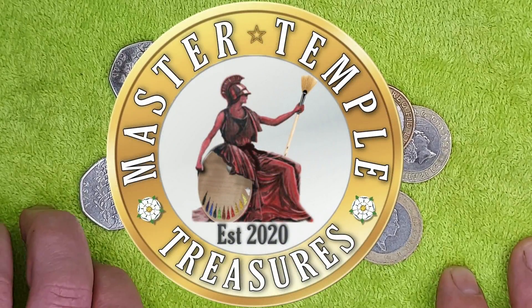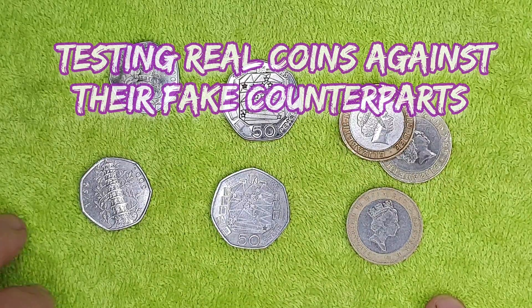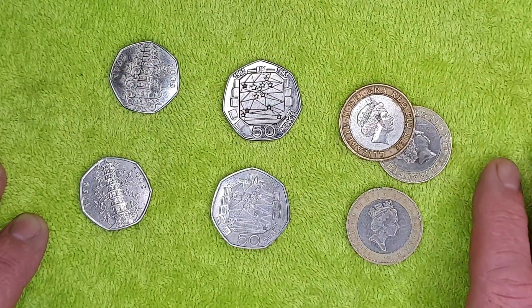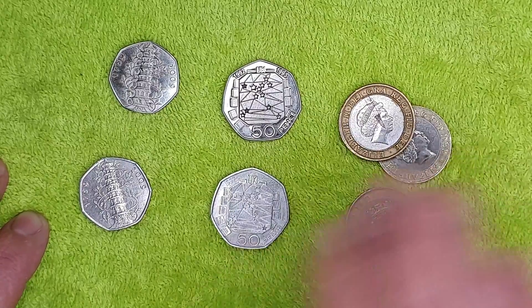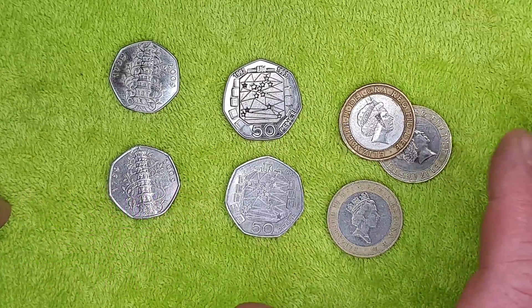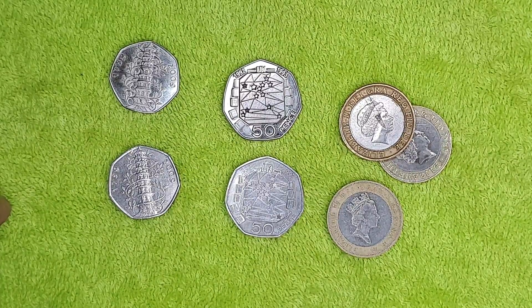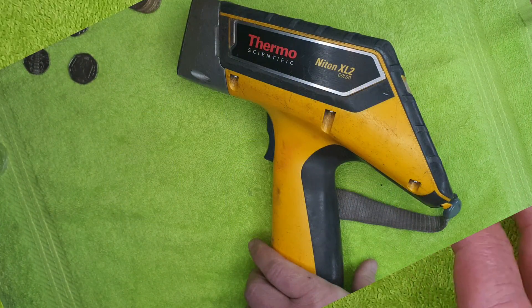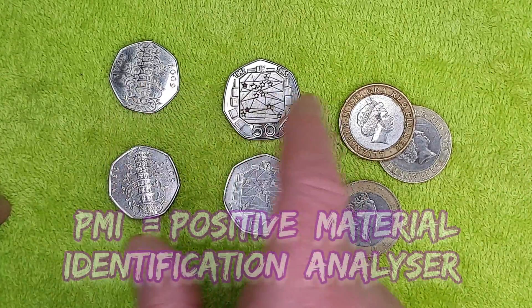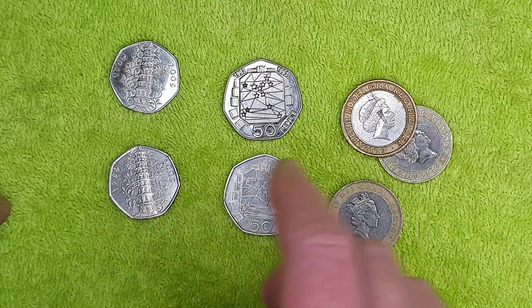Happy days, my numismatic friends! Today we are going to check real coins against fake coins using several different methods, including an amazing method I've never seen done before on YouTube. We're going to test the coins with a PMI analyzer — basically an x-ray gun that fires an x-ray at the coin, and the x-ray bounces back giving a digital readout of the metallic makeup of the coins.